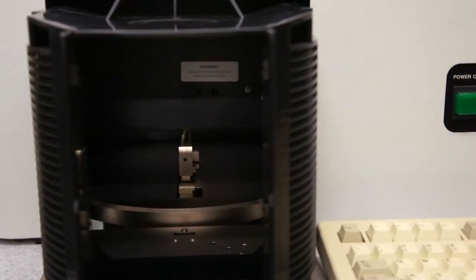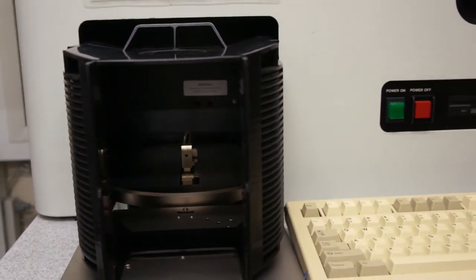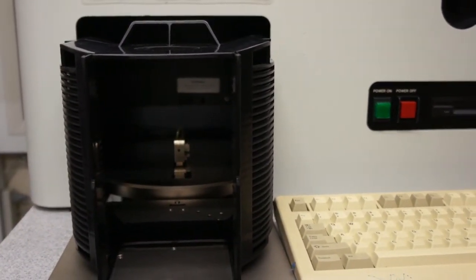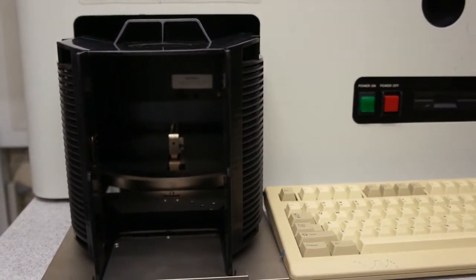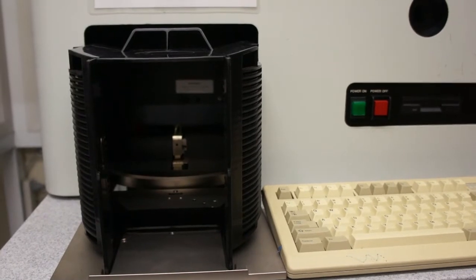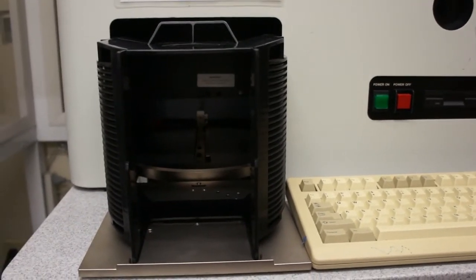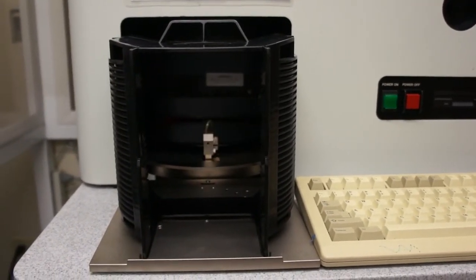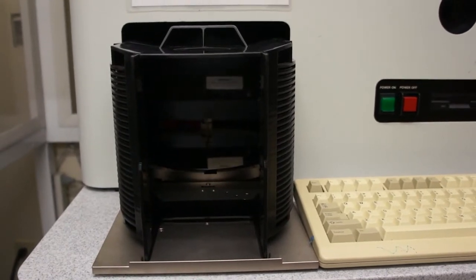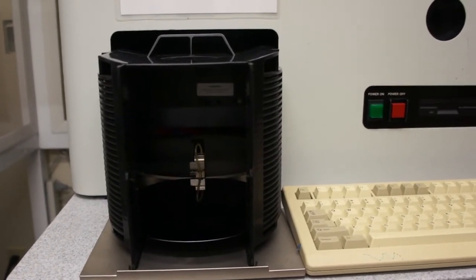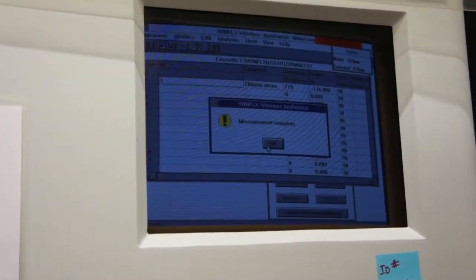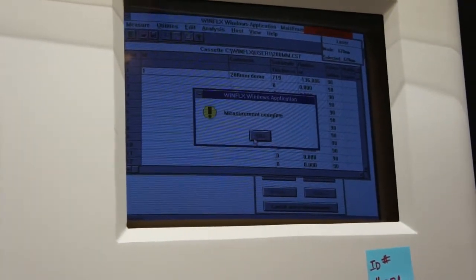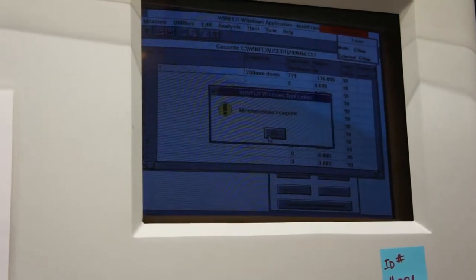Make sure that it's in-process here. Okay. Make sure we're completed. So that's just to demonstrate the 200 millimeter capability.